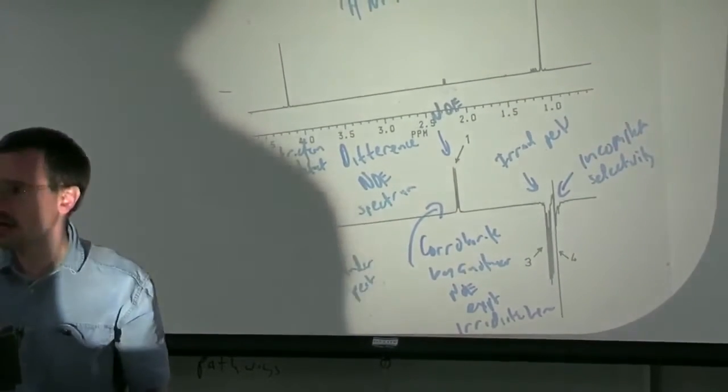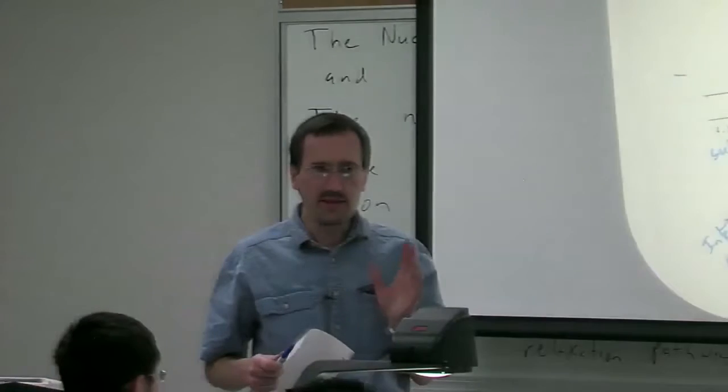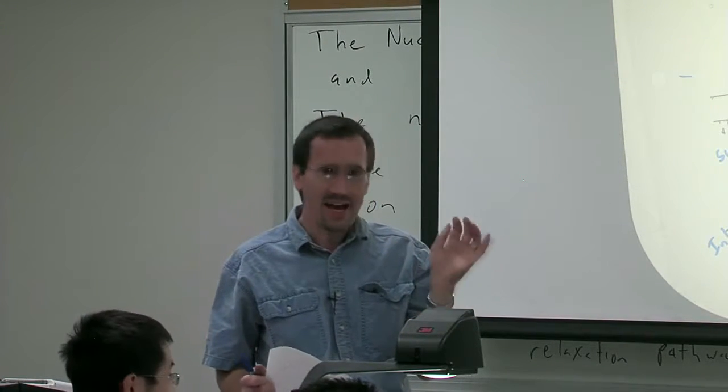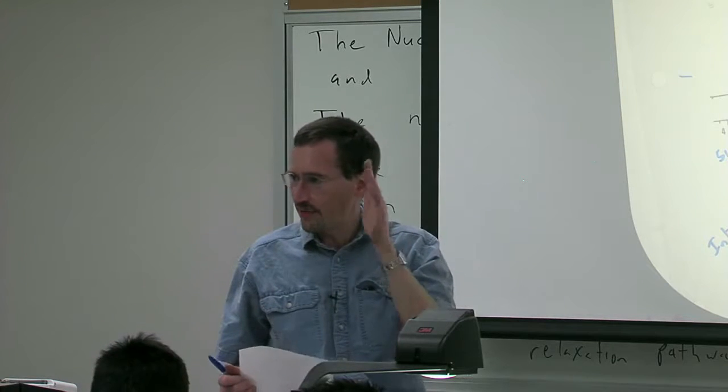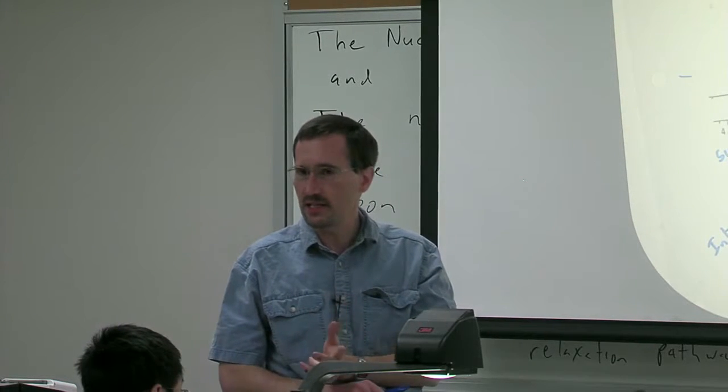Usually NOE experiments end up being done in sets. So you're going to do some 1D NOE experiments on strychnine. And this was the part of the course that everyone hated, so I've cut it down. I had you go ahead and hit every peak that could be hit selectively in strychnine. And honestly, it doesn't take that long.